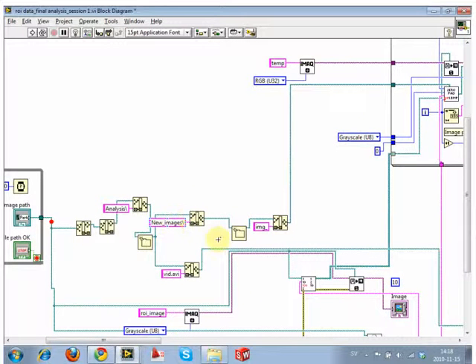It's unlikely to be in this path, because this path just writes the image files. This one is the folder for those images, so the problem's not going to be there either, because we're not even to that point. It's not finding the files. Could the problem be in this one? No, because this is writing a folder too. This is all subsequent analysis, so we know it's not in this section. We can leave this entire section out of the debugging because we know it's not there, which means it's got to be somewhere down here.